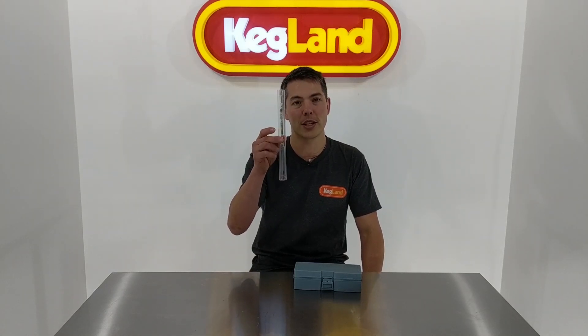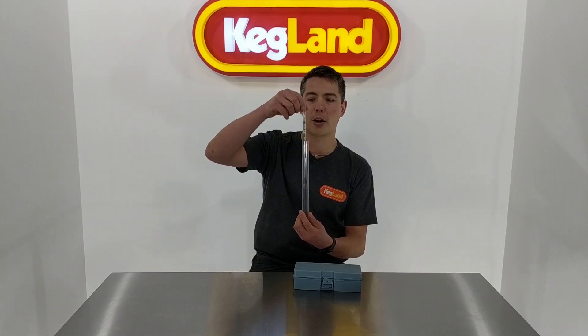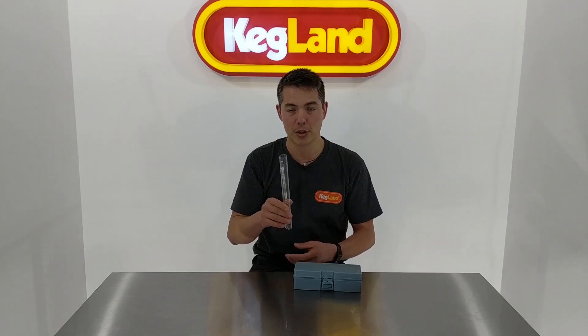Now in the past, a lot of you guys if you've started off in home brewing, you're probably using or have used one of these hydrometers. It's a basic tool — basically based on the gravity of the wort sample, it will float higher or lower depending on what that gravity is. Really simple.